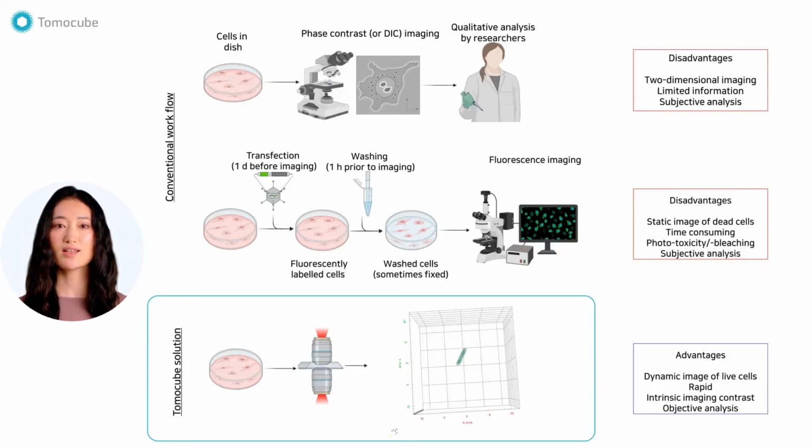To solve these challenges, Tomocube presents unique solutions based on holotomography, HT. HT measures the 3D tomography of live unlabeled cells within a few seconds. The reconstructed tomography has quantitative information, refractive index distributions, which can be directly converted into biomolecular concentrations. Thus, one can also retrieve quantitative bioimaging information such as volumes, concentration, and dry mass of subcellular organelles.